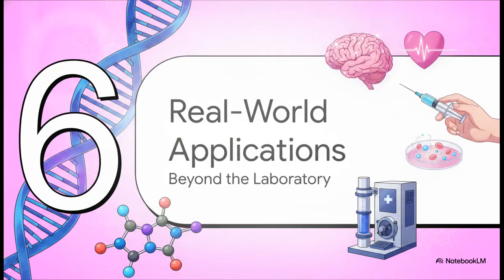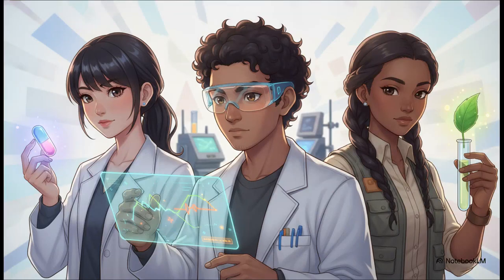Which brings us to Section 6, Real-World Applications, Impact Beyond the Laboratory. The applications of chiral chromatography go way beyond standard lab curiosities. It is literally the backbone of pharmaceutical development. It ensures regulatory compliance by proving a drug contains only the beneficial eutomer, whether we're talking about beta blockers, antidepressants, or antifungal agents. But it definitely doesn't stop there.